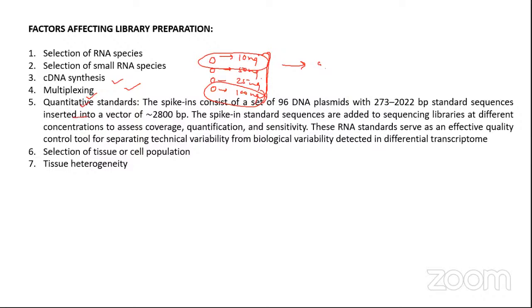Quantitative standard, as I mentioned to you, spikes in, selection of tissue or cell population, and the tissue heterogeneity. Those things also will affect our library preparation.